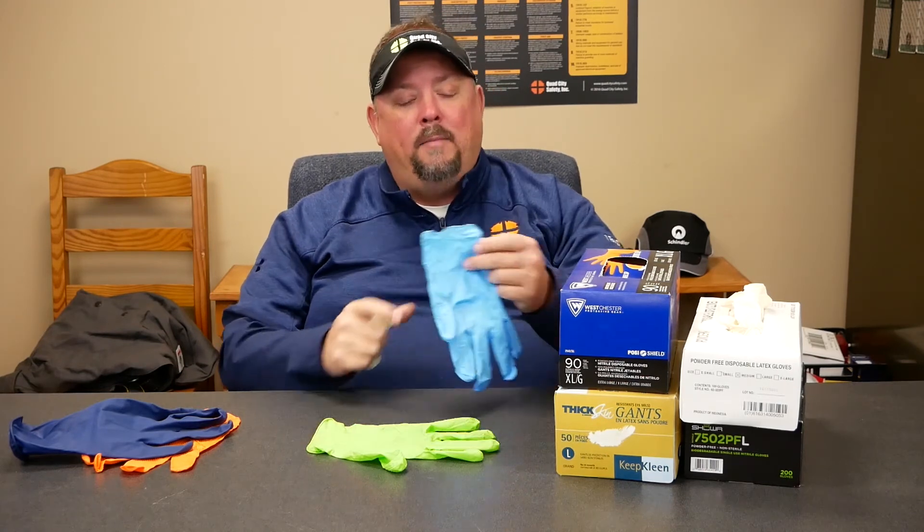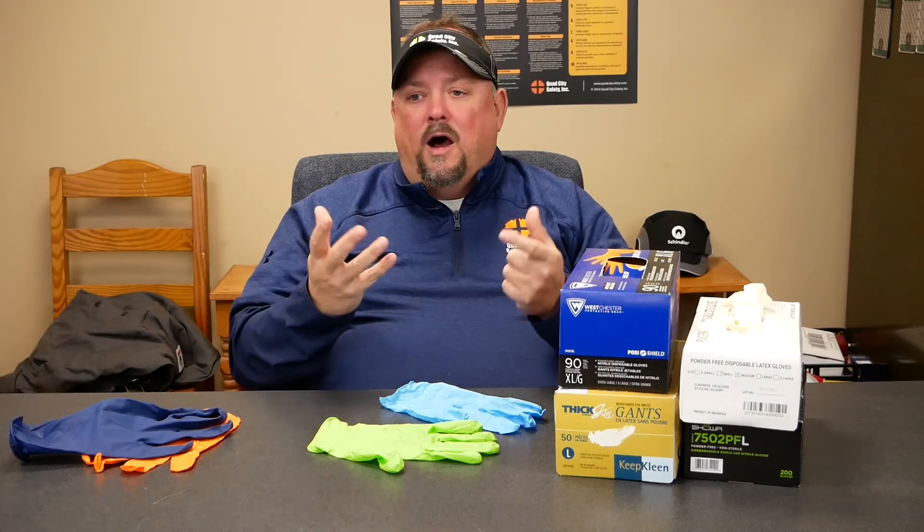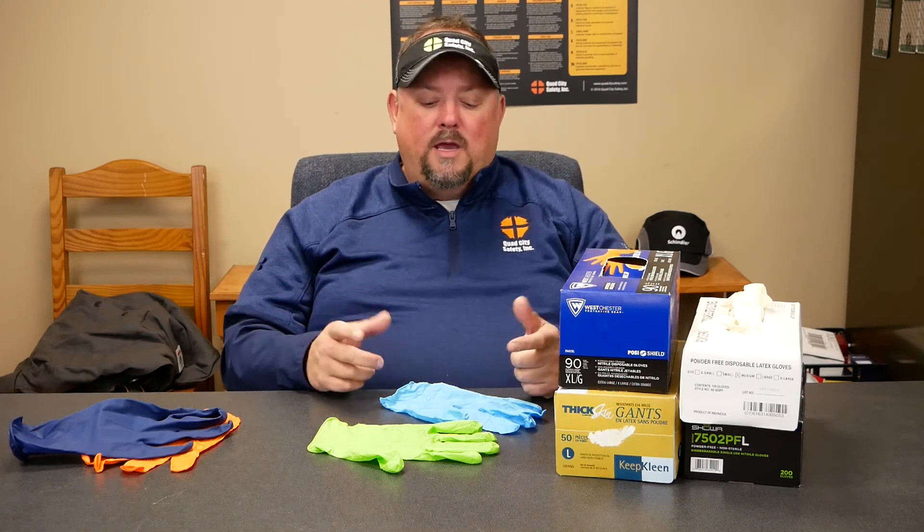A lot of what you have to figure out is: am I trying to protect myself from known pathogens, where I might need medical grade? Or maybe I'm just around light chemicals where nitrile works? Maybe I'm just trying to keep my hands from getting dirty, where vinyl is fine for a quick task with low exposure — something I can rip off and throw away.